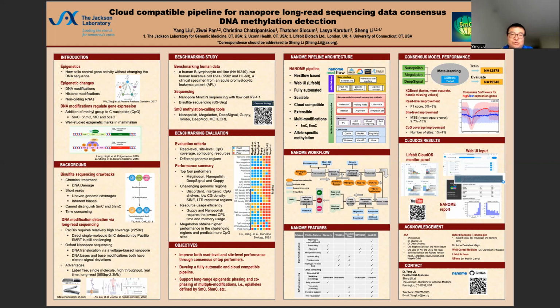To handle these issues, we developed the first NanoMe pipeline, which is based on Nextflow technologies and container environments, such as Docker and Singularity, for consensus DNA methylation detection using an XGBoost model, which is a gradient boosting algorithm, for nanopore long-read sequencing.